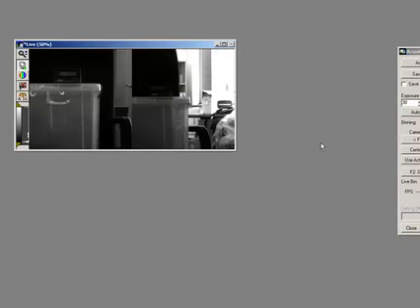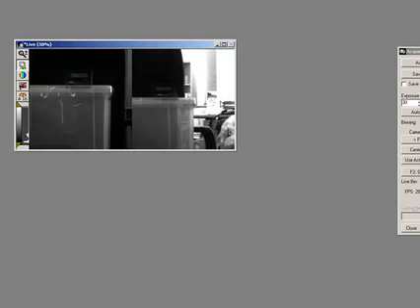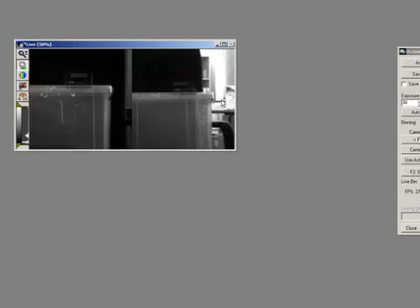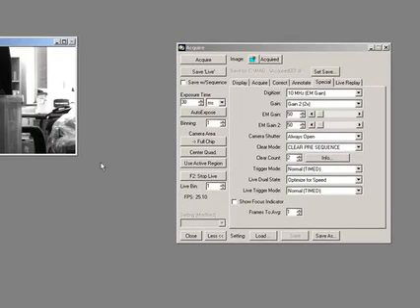So let's select that and then come to Acquire and our Acquire tab here. You can see that I've got separate EM gain states for my two different cameras, and if I just go live, you can see that I'm acquiring from my two cameras next to each other here. So I can move this one around and focus it in ever so slightly, and I can do exactly the same for the other camera over here. Now then, let's just get that pointing at my clock. So I'm happy with how this is going here. You can see I'm getting 27 odd frames a second out of these cameras in my live preview.